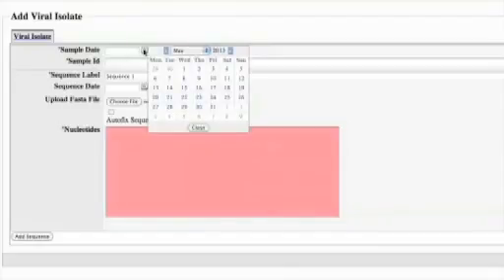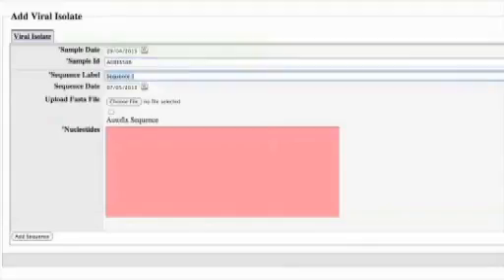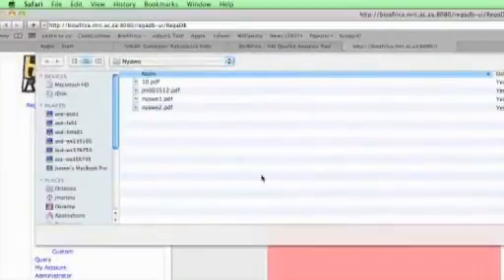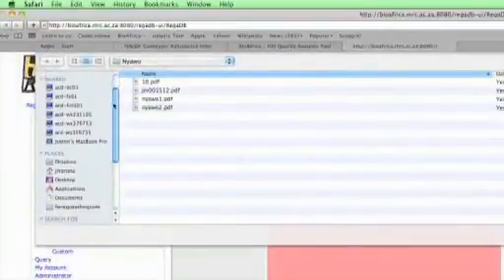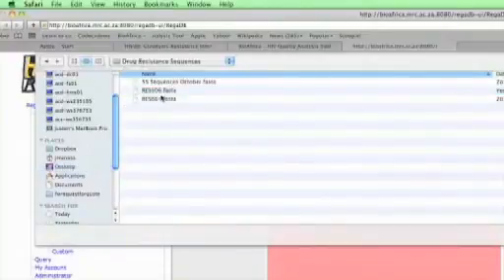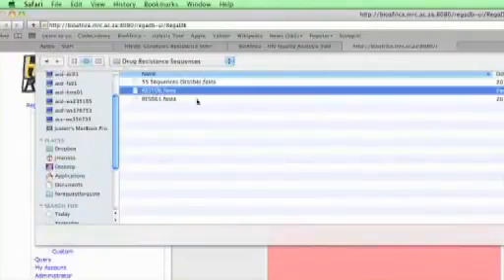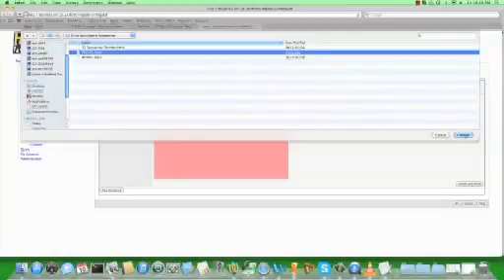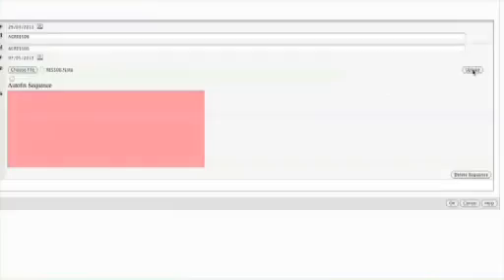Enter the sample date, sample ID, sequence ID and sequencing date. Select choose file and then navigate to the FASTA file to be uploaded. After selecting the FASTA file to be uploaded, click on upload. Once the uploaded sequence appears in the nucleotide box, click the OK button at the bottom right of the window.